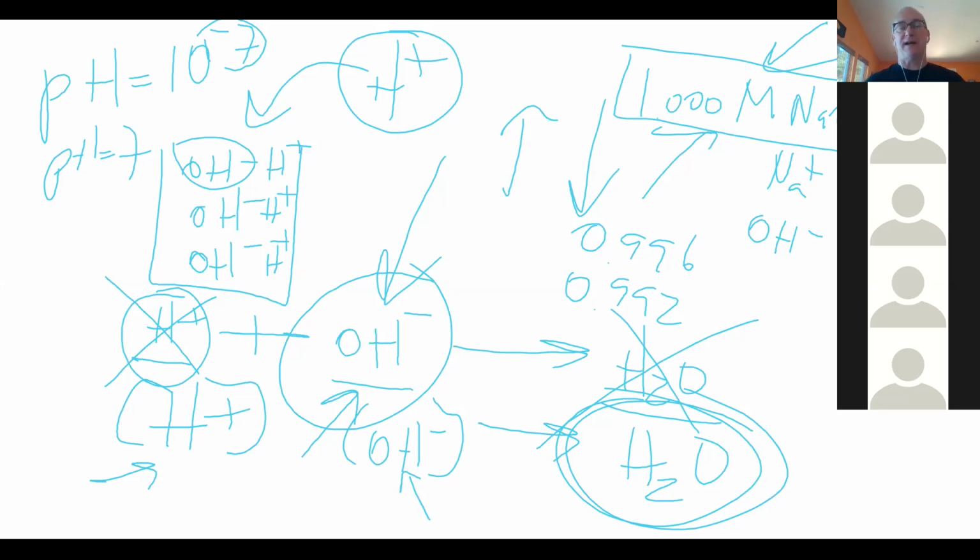That's right. So we use it when we start with something acidic, because at a pH below 7, it's colorless. You don't really see it. But if you add base to it, the minute it gets to around pH 7.5 or 8, it changes pink. And if it goes way beyond pH 8, it gets really dark pink. If we were doing it in the lab, it's really quite dramatic.